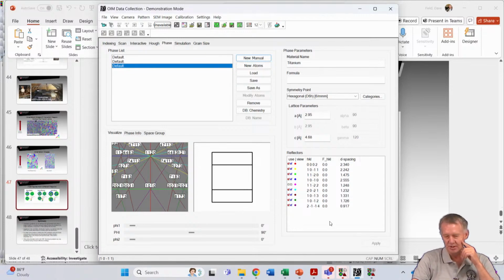Okay? So you can come in here, click your right mouse button and add or delete different bands. So this is the one we just added. This is the one we just deleted. So it's done that for us. I don't want to do that, and I think it would undo them anyway, but let's go back to how it was.